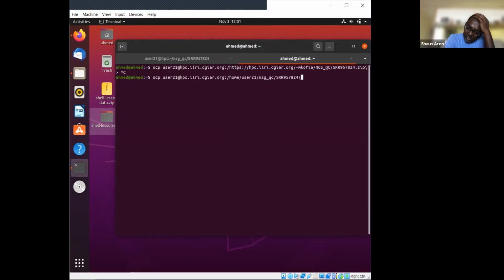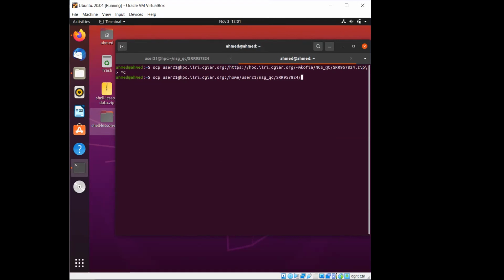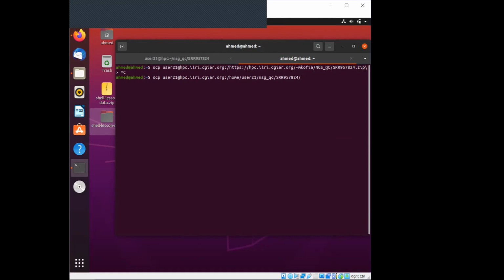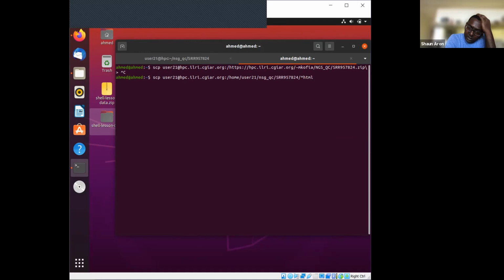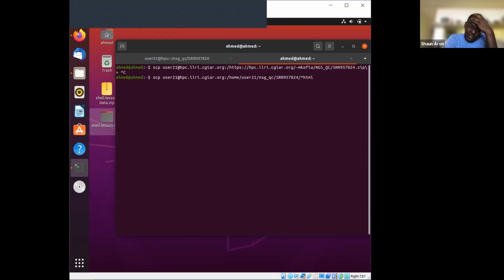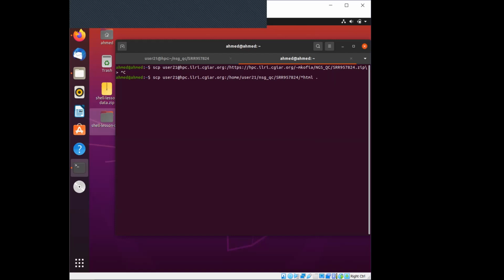Okay. And the other one. Star HTML. Star. Yeah. HTML. And then enter. Space. Dot. Enter.